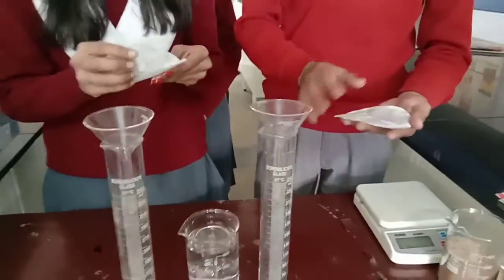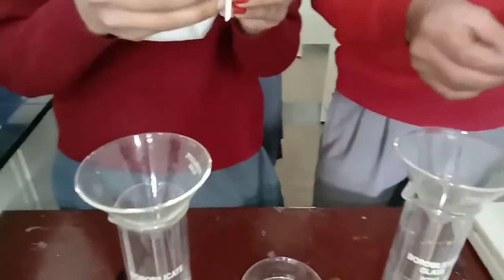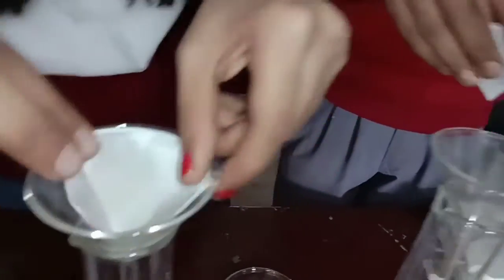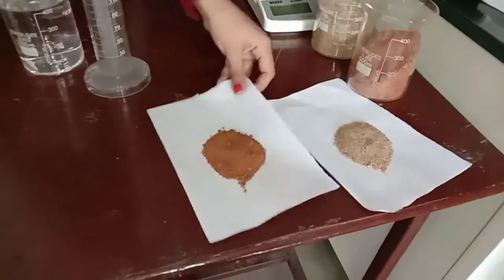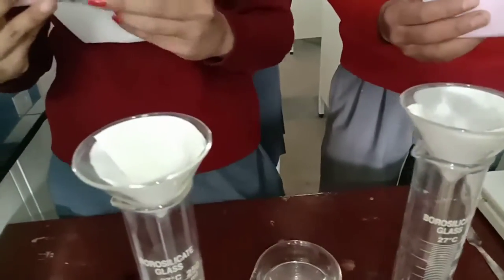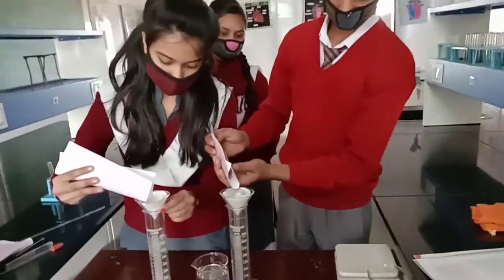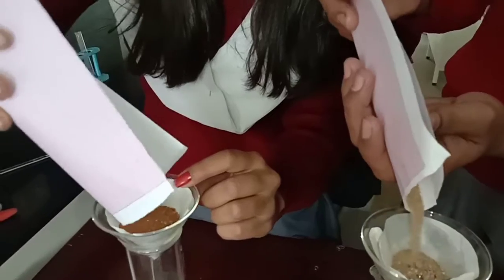We'll not pour all the water, but just slightly wet the filter paper. Finally, we will place the filter paper over the funnel. After that, we will take the soil sample, of which we have measured 25 grams, and we'll pour that over the filter paper like this.